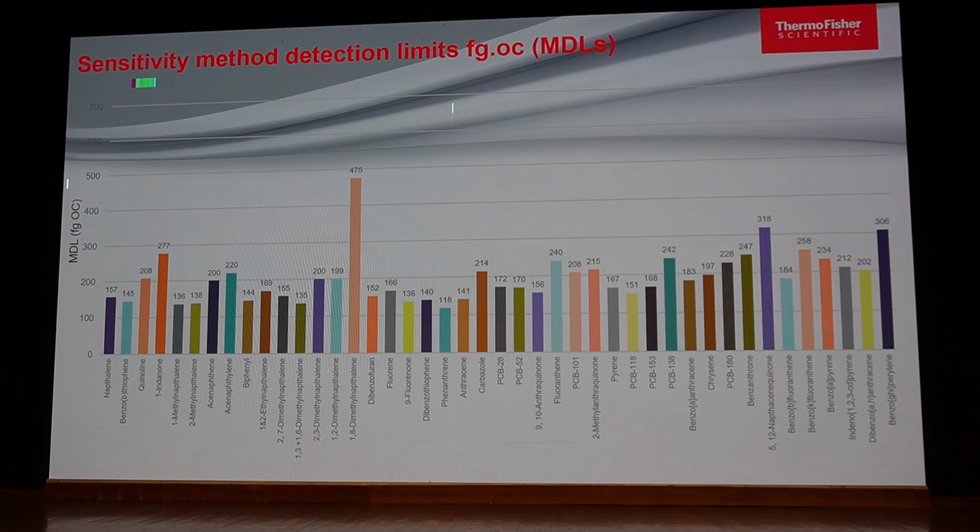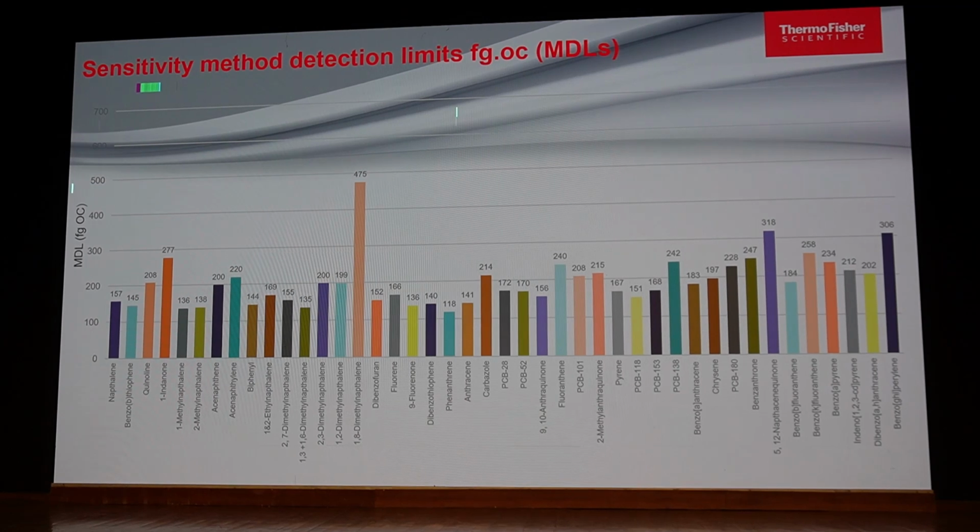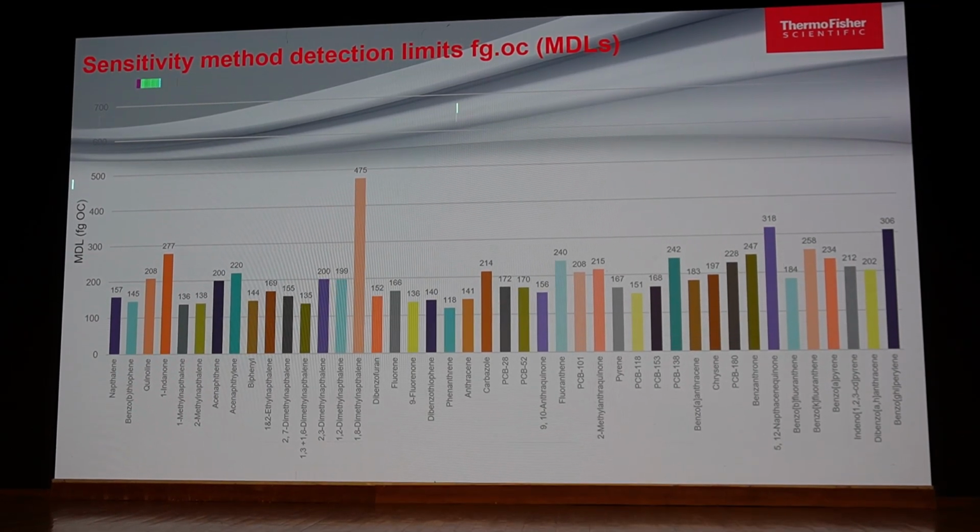Now, when you are looking at this full scan analysis, everybody will ask how a full scan analysis can provide the best sensitivity. This is an exceptional case in HRMS, where we are doing full scan analysis and achieving sensitivity as good as your triple quad system. When you use a triple quad system for an MRM or SRM based targeted quantitative approach, a similar sensitivity you can achieve from full scan analysis by using HRMS, either at 60,000 resolution or maybe 240,000 resolving power, both.